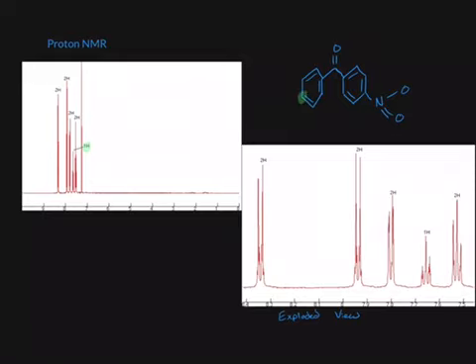That is our 1 group. This can be our 2nd group, this carbon and this carbon right here. And then our 3rd group, which is here, goes to this carbon here. So we will go ahead and mark those in.